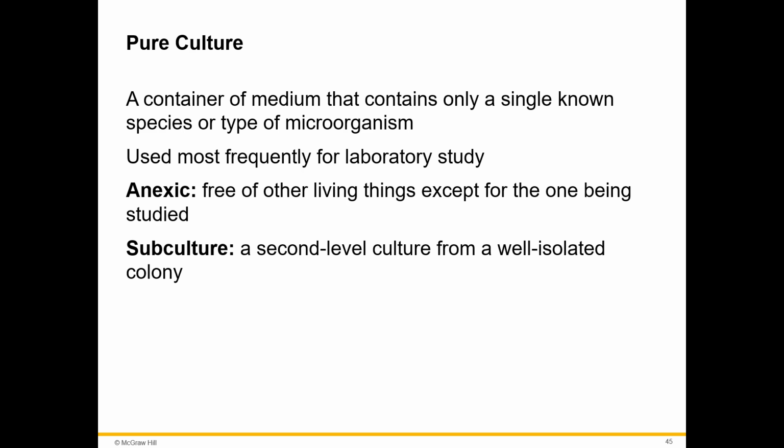So we'll take that original culture, we will reactivate it, whether it needs to be mixed with solution and kind of woken up a little bit, or whether it's ready to go from a slant, we're going to then culture it into a second media source. It's still a pure culture, we're just taking that original culture and subculturing it, putting it into a new media. And then we're going to use it in experimentation.